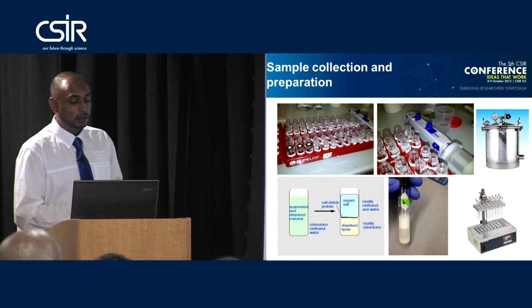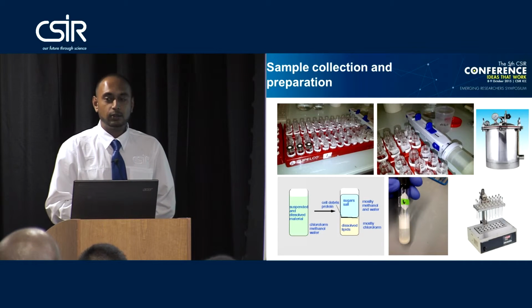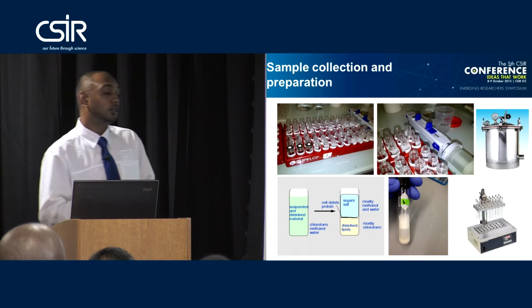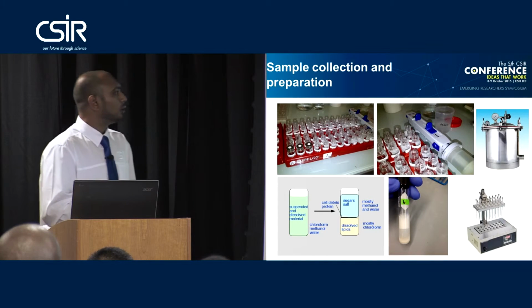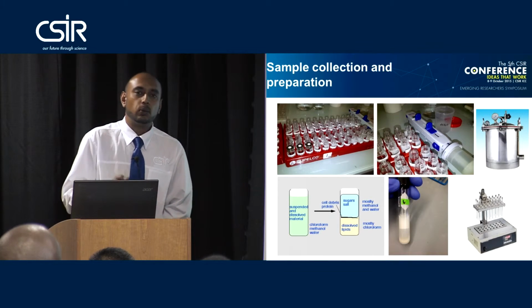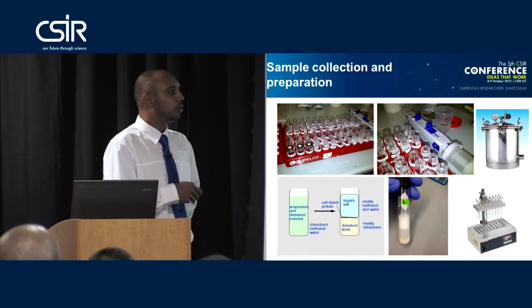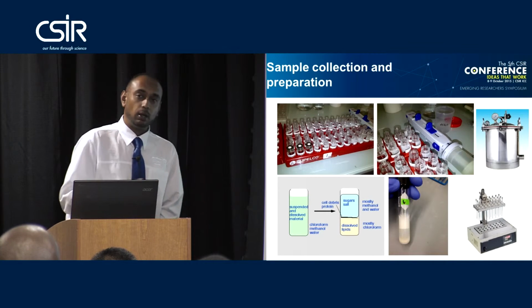The most recent part of this study was a collection of 4 different categories of mycobacterial resistant strains: a wild type compared to single resistant, either rifampicin or isoniazid resistant, and multi-drug resistant TB. So in brief, these were collected in 2 different types of solvents. We collected in a potassium hydroxide solution to saponify the mycobacteria. We also collected in distilled water, and both of these collections were autoclaved at 130 degrees Celsius for an hour.